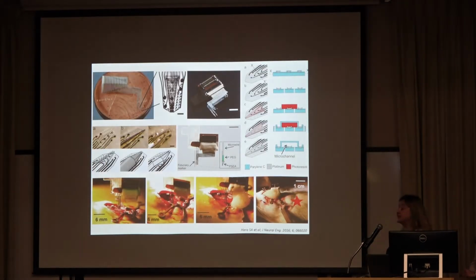Also, with chronic devices and electrophysiological recordings, there are several papers around. I just put this because in almost every one of them my point will be the same. Even if it's a rat or a mouse, when people fix these things, they use screws and acrylic all over the place, which blocks the ability to image through them. You can record for a chronic time, but this will not allow you to image. Now I'm giving it to Lorraine to talk about the devices.